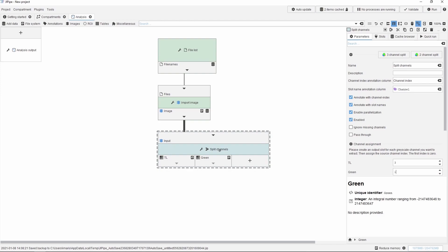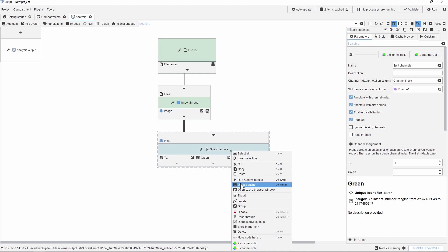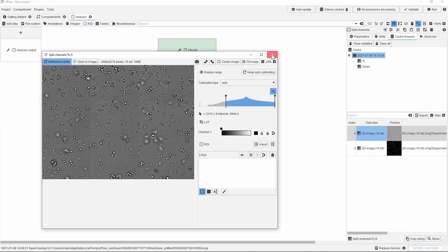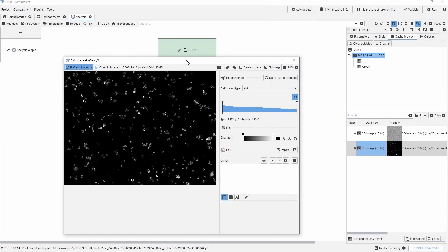Jipipe conveniently includes a feature that allows to process the pipeline up to a selected node and store the results into a memory cache. To make use of this feature one only has to right click on the node and then run update cache. This will then display all the results in a table. In order to visualize any of the results you have to simply double click on an entry and this will open the result. This now concludes the image loading and channel splitting in Jipipe.